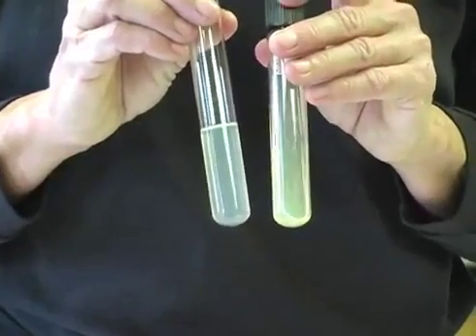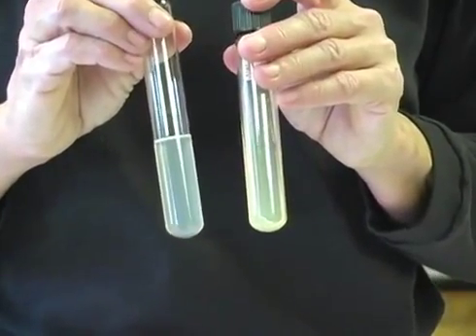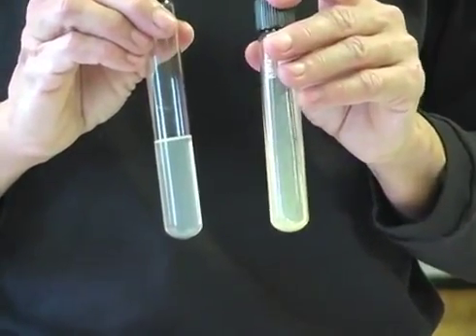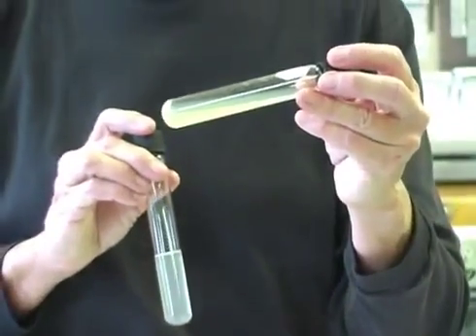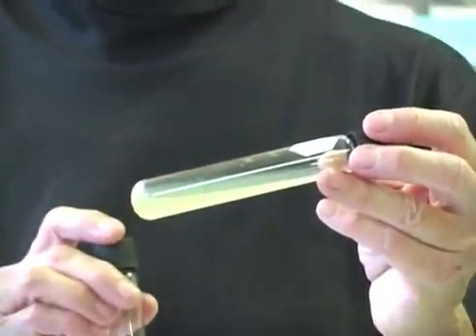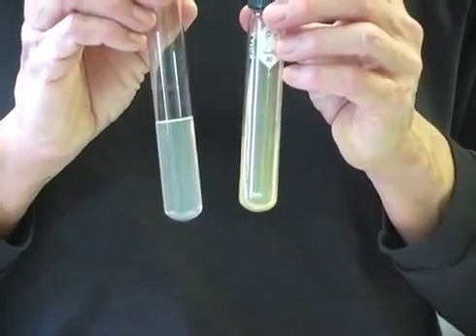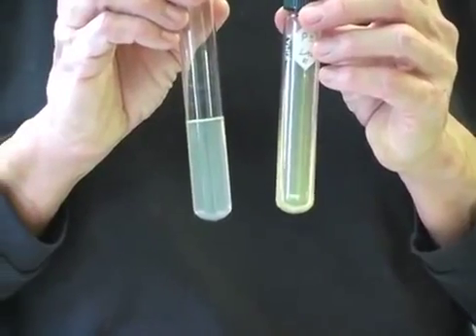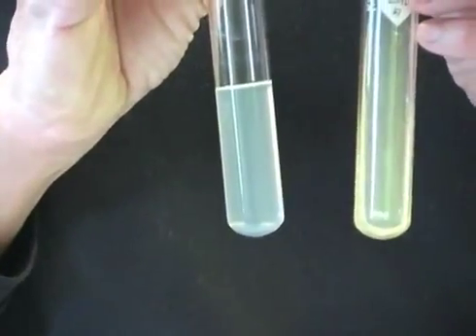Solid media, which we describe as agar, may be placed in several different types of containers. If the solid media is placed into a test tube and permitted to solidify at an angle, such agar is referred to as an agar slant. If the agar placed into a test tube is permitted to solidify in an upright position, the tube is referred to as an agar deep.